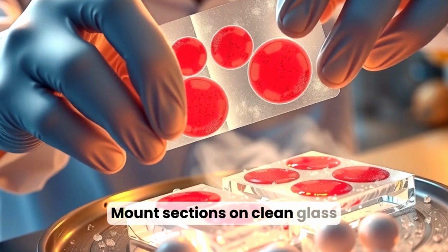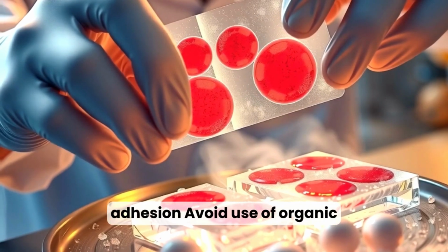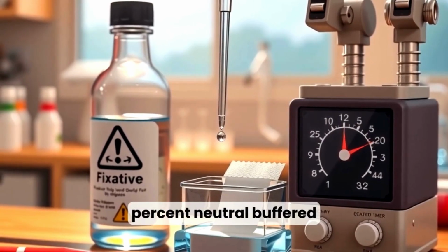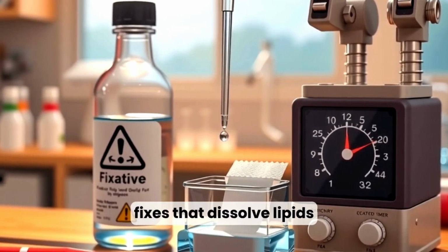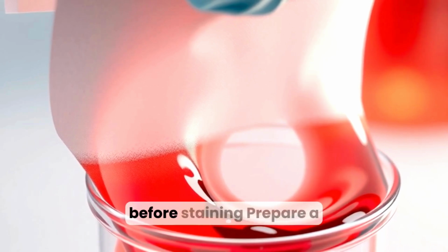Mount sections on clean glass slides warmed briefly to aid adhesion. Avoid use of organic solvents for fixation that would extract lipids. Fixation can be brief in 10% neutral buffered formalin or 4% paraformaldehyde for a short time, avoiding alcohol-based fixes that dissolve lipids. Rinse slides with running water and air dry slightly before staining.